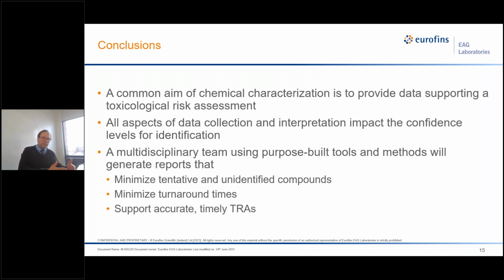It looked like discussing the initial methods for the data collection, the choice of methods, right? So we might do ESI a certain way, but then we also add APCI in the case of LCMS. Interpretation, we talked about software. We talked about building tools outside of software like databases. And then we talked about the training of interpretation. All of these things impact the confidence levels for identification. And an effective program is really going to push for improvement on all of those areas.